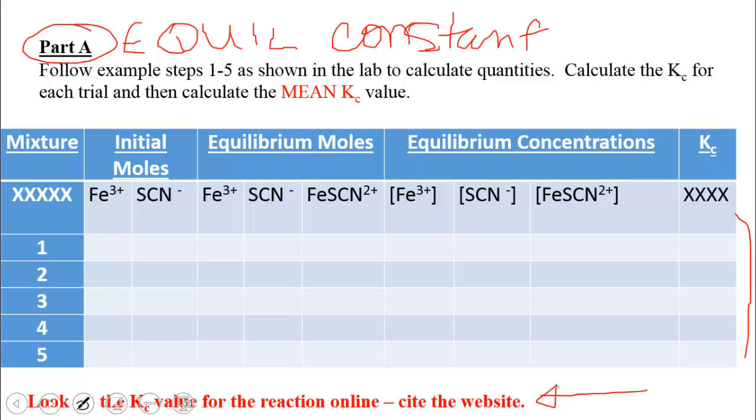So what I've done here is I've set up a table for my results. These are calculations that I am doing. You do not need to have this table pre-written out in your lab notebook because you will not be doing any of these calculations during lab. Now you may want to have this table in your lab notebook for later so that you can utilize this information for, let's say, a lab quiz at the end of the term.